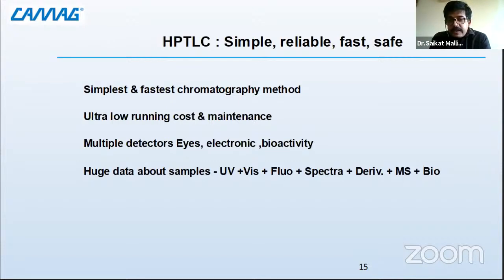But with this kind of approach, you don't need to do all those things. Simply whatever you're doing as a chromatography, take the plate, subject it to the microbial culture. And if it is showing you the activity, your point is proven. And immediately you can bring a new molecule into the market, which will be having an antimicrobial activity.